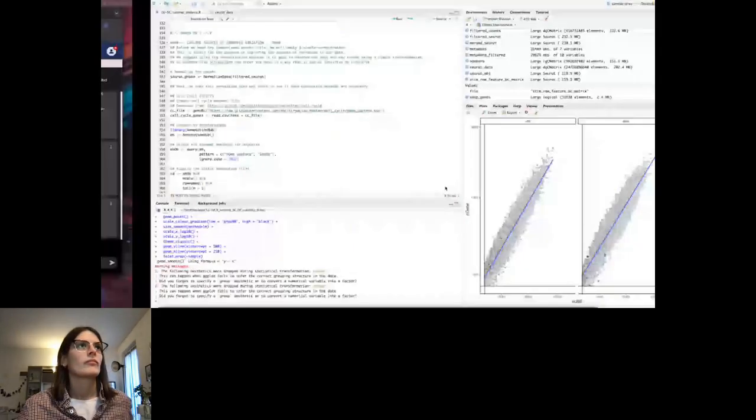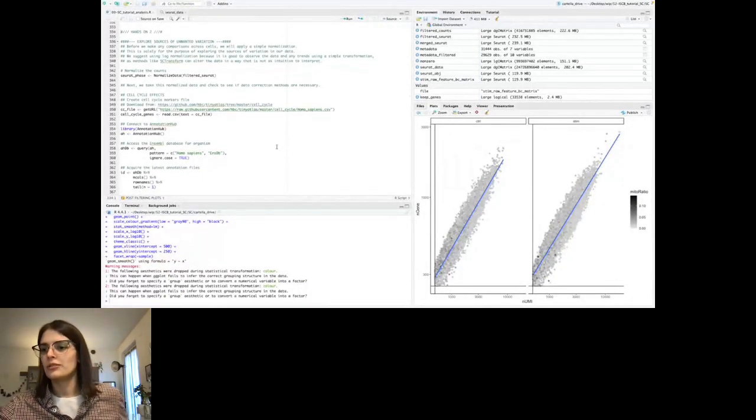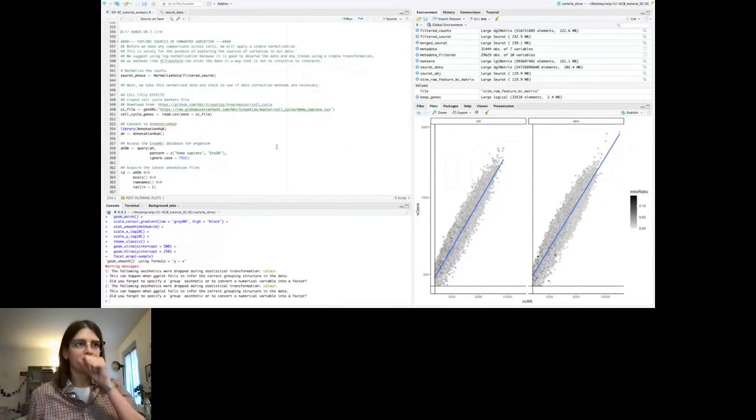We will now go to the second hands-on. So I will share the screen if I can. Okay. And this, share. Okay. So you should see now the RStudio environment, just where we left off.